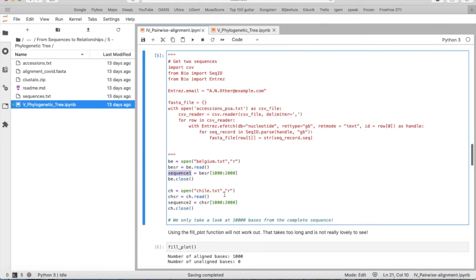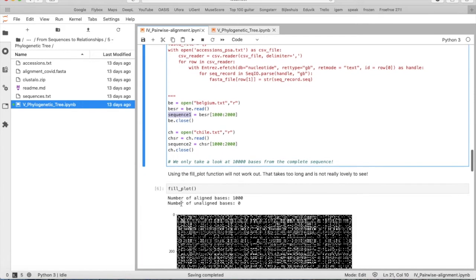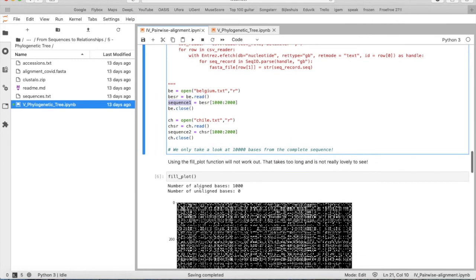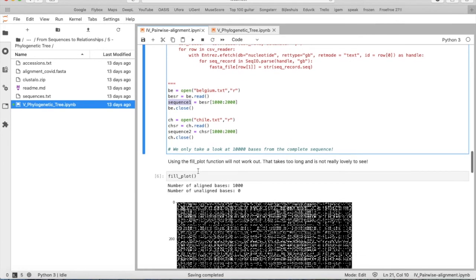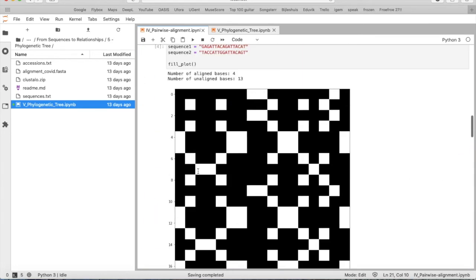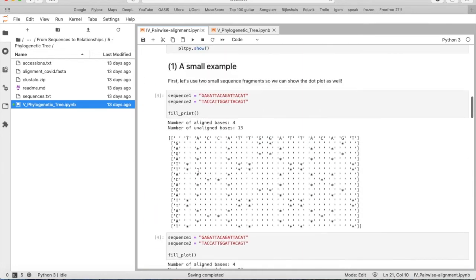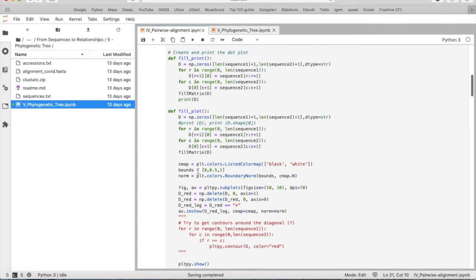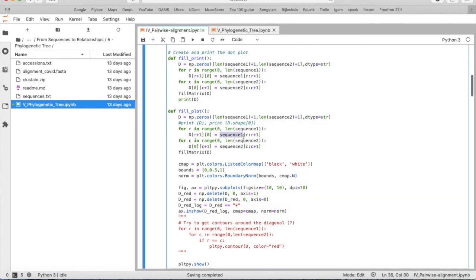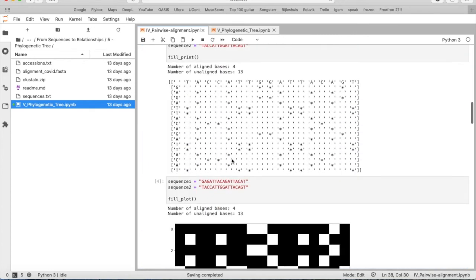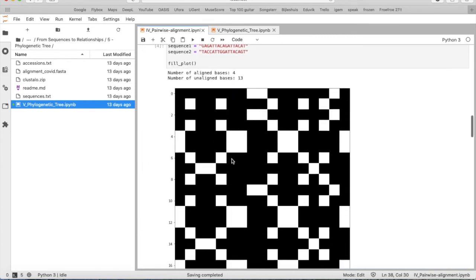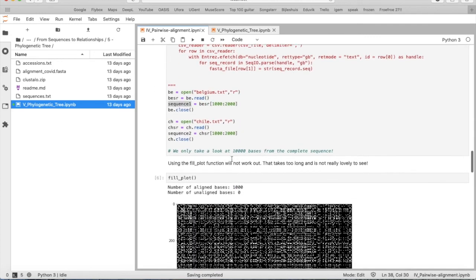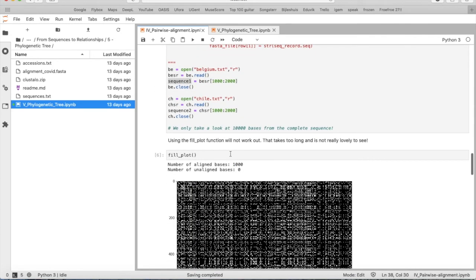We do the same for Chile. And we have now sequence 1 and sequence 2. We do now fill_plot. And you see, I have not set sequence 1 is this one, sequence 2 is this one. Because when we take a look at fill_plot function, let's have a look here. I already put sequence 1 and sequence 2 in. So if you just name the sequences that you want to compare as sequence 1 and sequence 2, the function will do the rest for you.